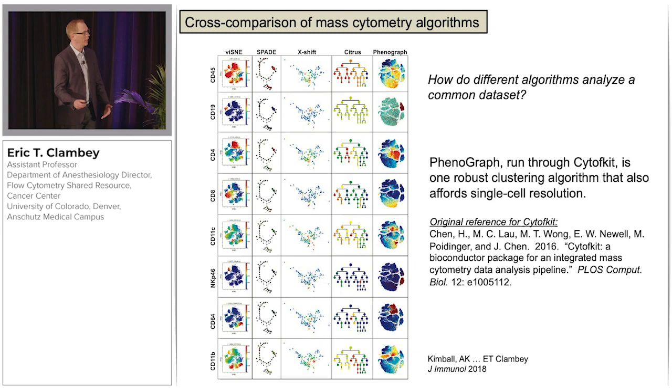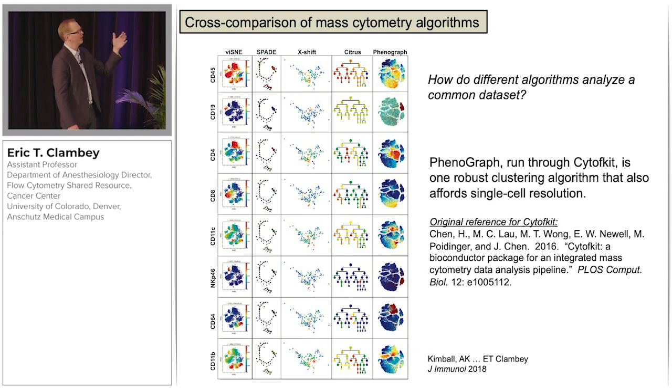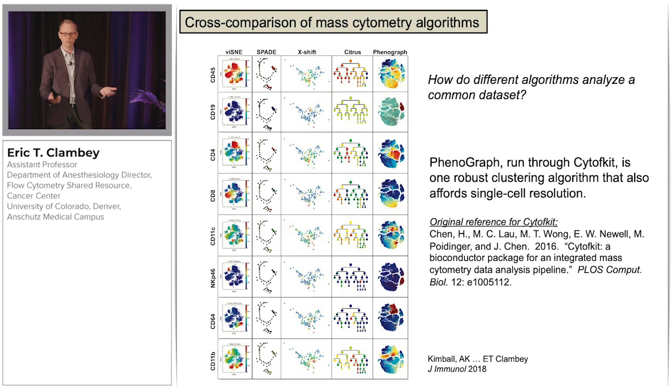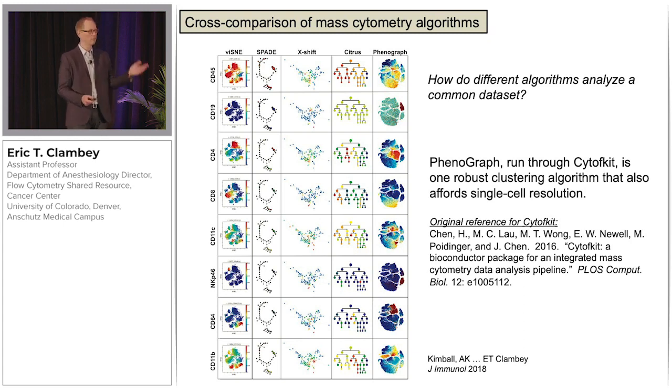So as I pointed out, there's not a single right way or wrong way to analyze this data set. But if you think about interpreting these different data visualizations, there are important considerations that you need to keep in mind. I would strongly encourage the use of clustering algorithms that allow single-cell resolution. And while there are multiple solutions for that, we've found that frequently the Phenograph algorithm in CyTOF Kit has met many of our experimental needs, complemented by the strategic implementation of additional algorithms.